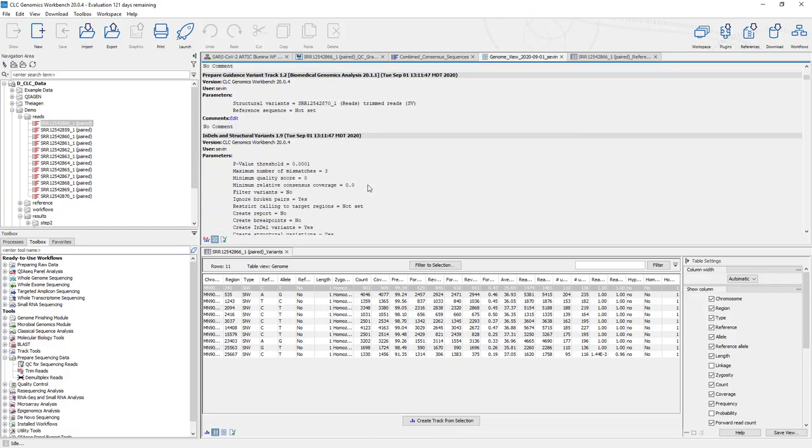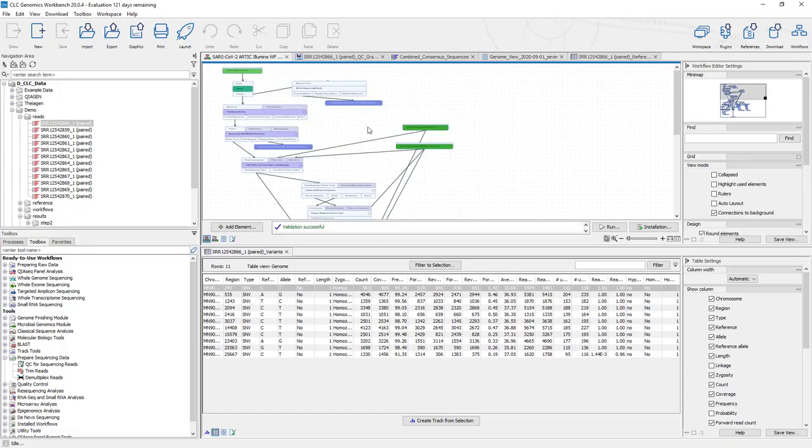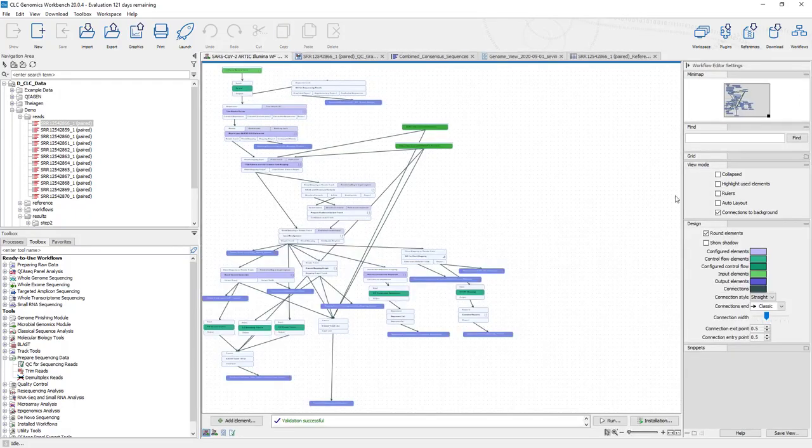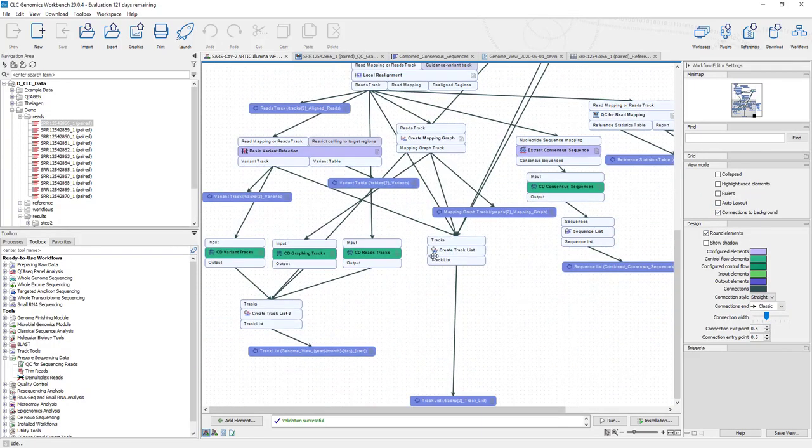that are in microbiology. So what we'll do for this tutorial series is we are going to build this workflow step by step that you see here, so that it is a lot less confusing than it looks right now. And for each step, we'll discuss the outputs and how they connect to the next modules. We'll discuss a little bit about the configuration, the inputs, the references, and in the end, you'll have your own developed workflow that you can use to generate your own results for SARS-CoV-2 sequencing.